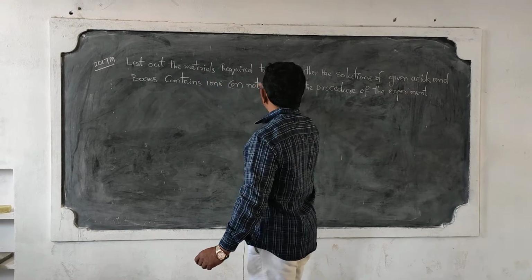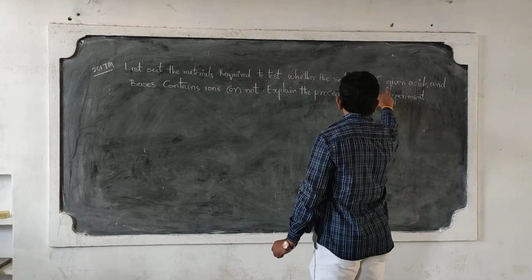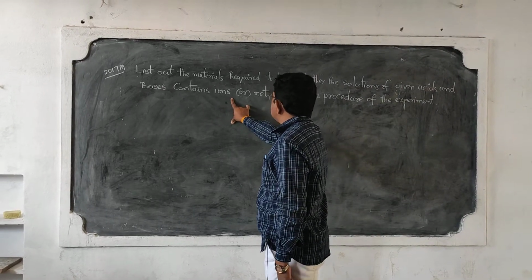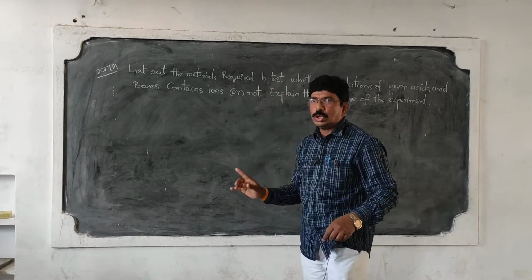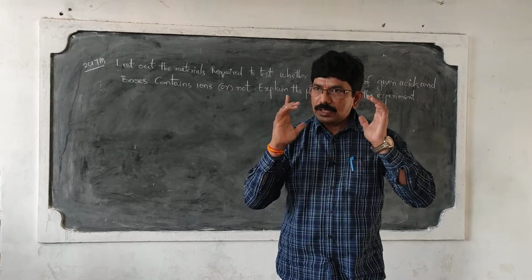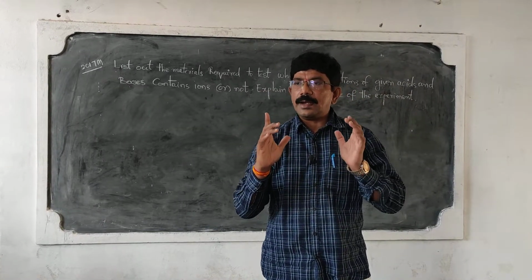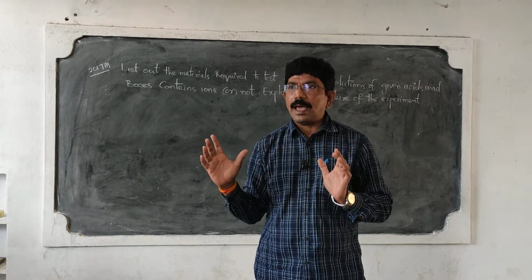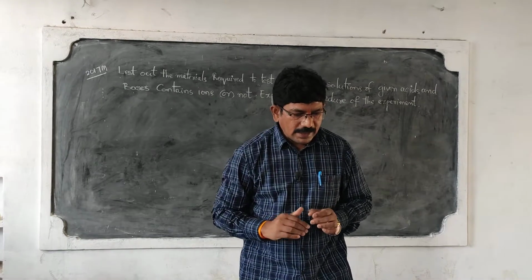List out the materials required to test whether the solutions of given acids and bases contain ions or not. Means those solutions which have ions will only conduct electricity. Are you clear? To prove this lab activity, what are the materials required?